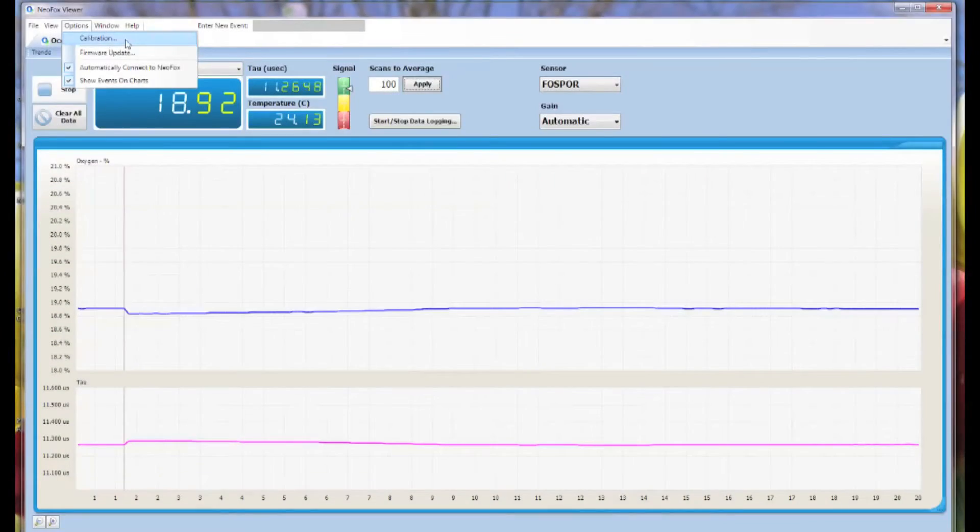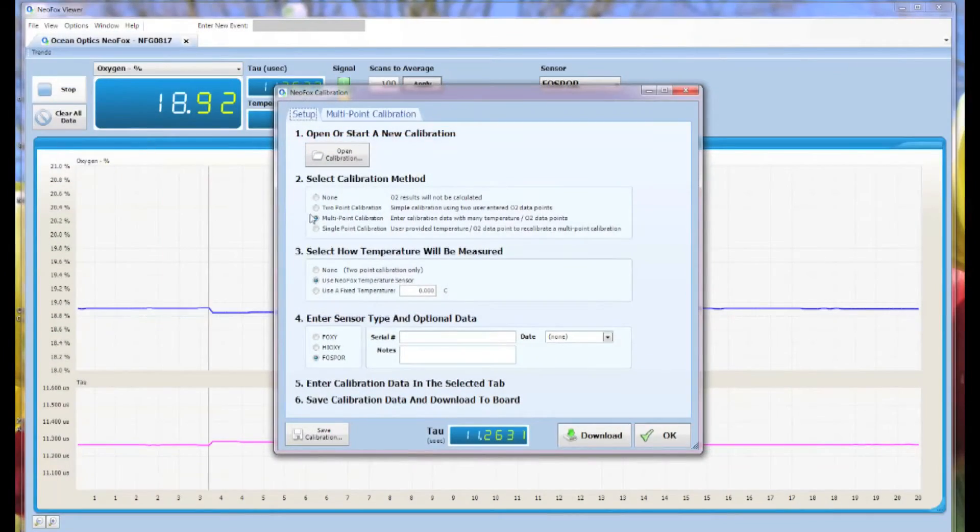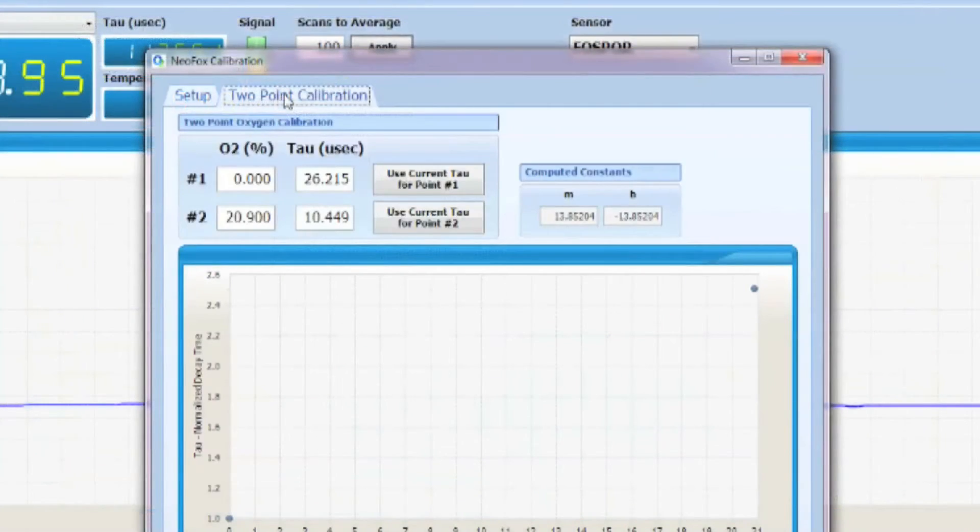Again, you will go up into options, click calibrations, and go into the setup box. Click two-point calibrations and make sure you have the correct chemistry chosen at the bottom of that box. You're going to click use current tau for point two.